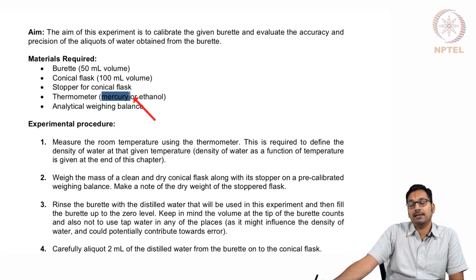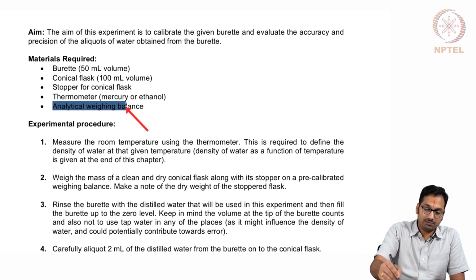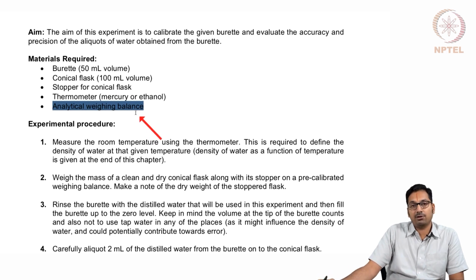You are able to realize that depending upon the setup that you are going to end up having, the apparatus also could slightly change, and a judicious choice of the same has to be done while you are about to set up the experiment. Last but not the least, one of the important equipment that one might end up needing in this is the analytical balance, which would help us determine the amount of aliquots that we end up adding.